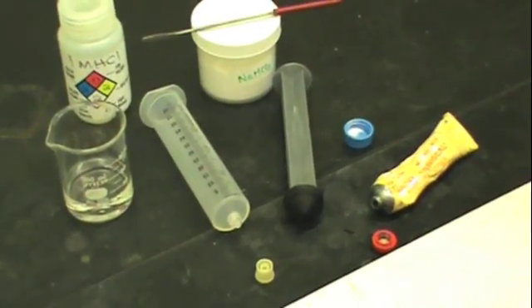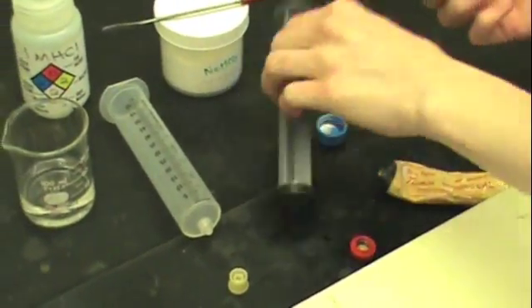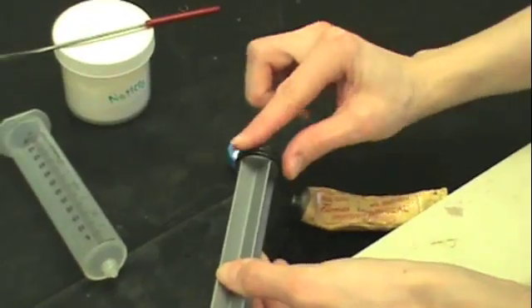Obtain a 60 milliliter syringe and plunger. Then put some grease on your finger and grease the plunger very well so that it slides easily.